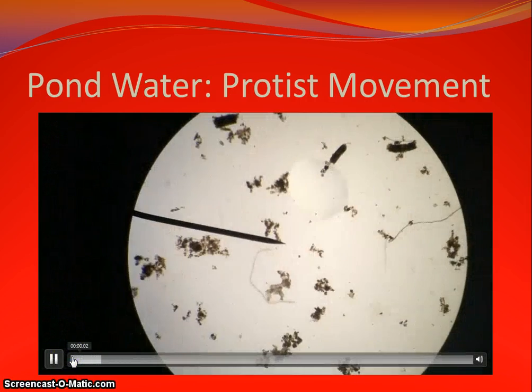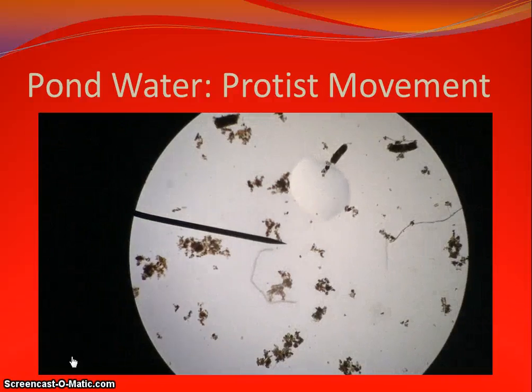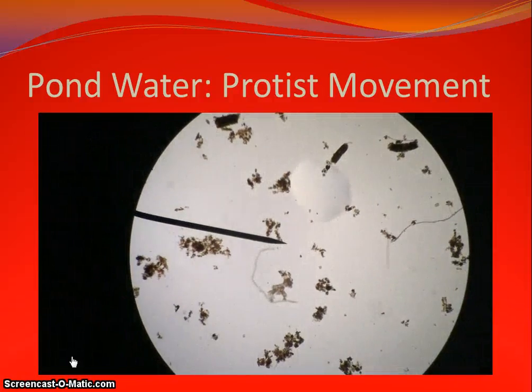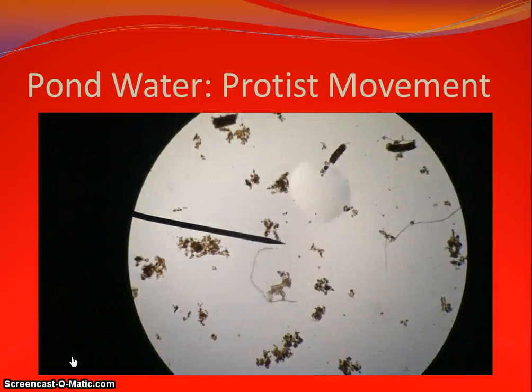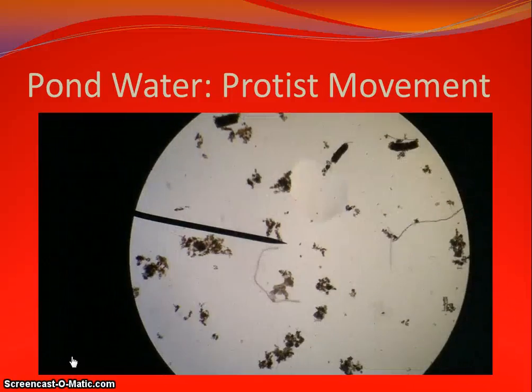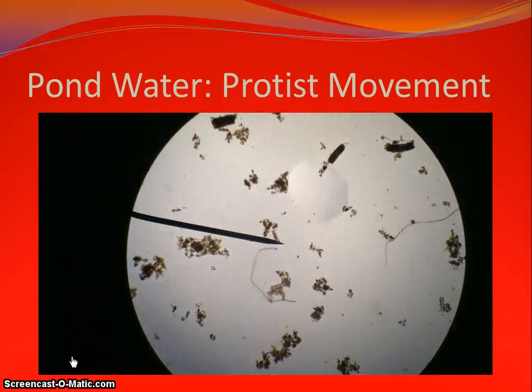Here's another video of us observing the protists moving within our water, and you can see, although they're very small, you can see them moving. Of course, with their flagella and pseudopods, although it's very difficult to see them because they are so small.